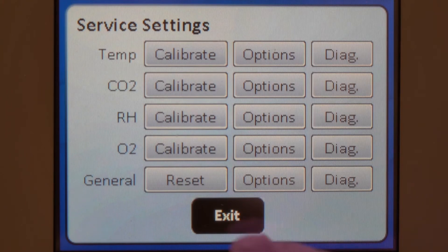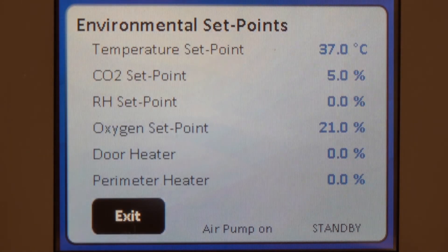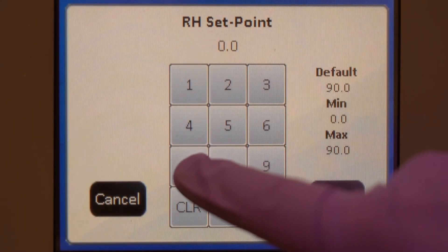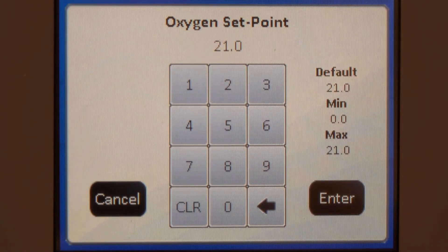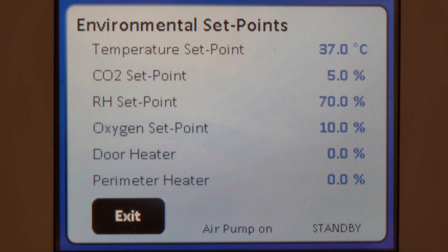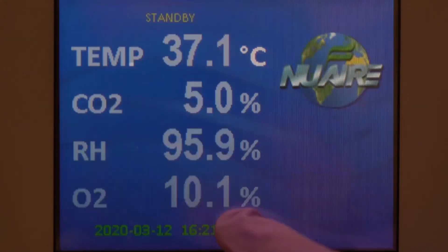Exit to the system settings screen. Reset the actively controlled RH setpoint back to the desired value. Remember to save when you're done. Exit back to the main screen.